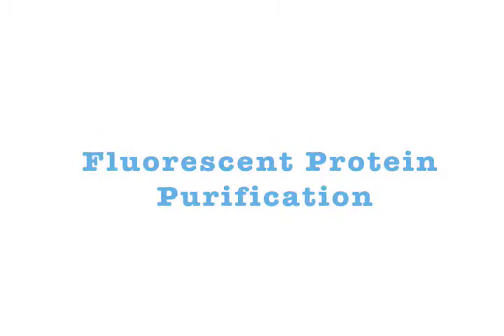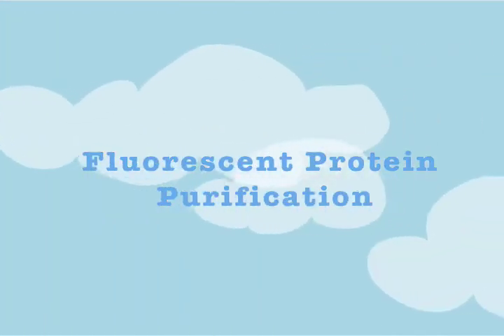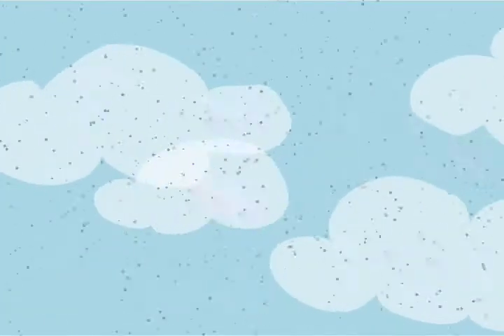This is a lab video from Science Bridge and High-Tech High. Fluorescent protein purification.